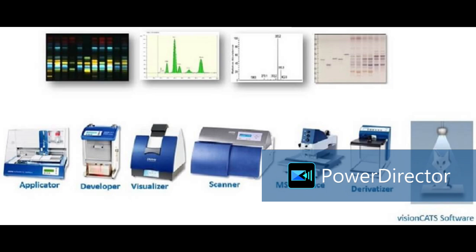This violet color portion is nothing but the statistics software has applied to the chromatogram and calculated the area of each peak. And by using the multi-level calibration curve method, we can quantify the amount of specific analyte from the samples with standard. But here for quantification, standards are required generally.